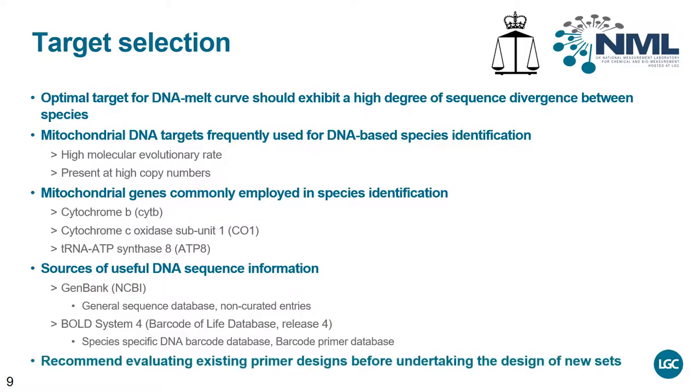However, before undertaking the design of new primer sets for a DNA target, it is recommended that a search for and performance evaluation of existing primer sets should be performed.